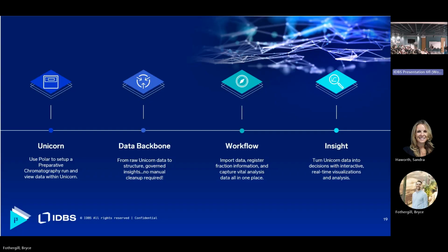I touched on it a little bit, but even for ligand binding, with our workflows and future integrations, we can take that data and bring it into an Insight app.